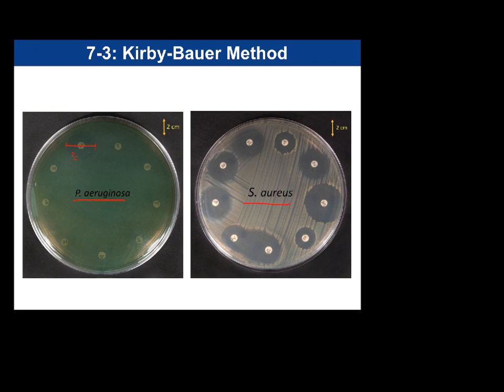Pseudomonas is known for being resistant to a number of different antibiotics. We talked about this earlier in the semester, it is a problem in burn patients. They can become infected and then be fighting a Pseudomonas infection. I talked in my lecture about Pseudomonas biofilms on IV catheters and how that was an issue. It's mainly got a lot of resistance factors, and so it's one of those that we keep our eye on.